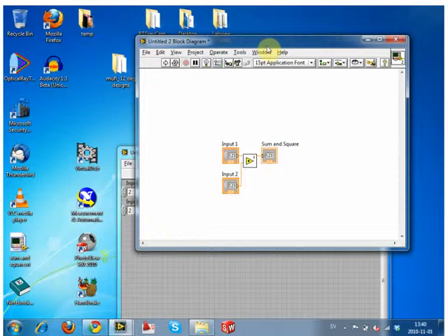Do you have something that looks like this? It was a free indicator, or I don't remember. So if you delete this guy first, okay, hover over the VI, then right click on that and go to create control, because we have to tell it to do something. So we need a control. An indicator is a result. Yeah, okay.